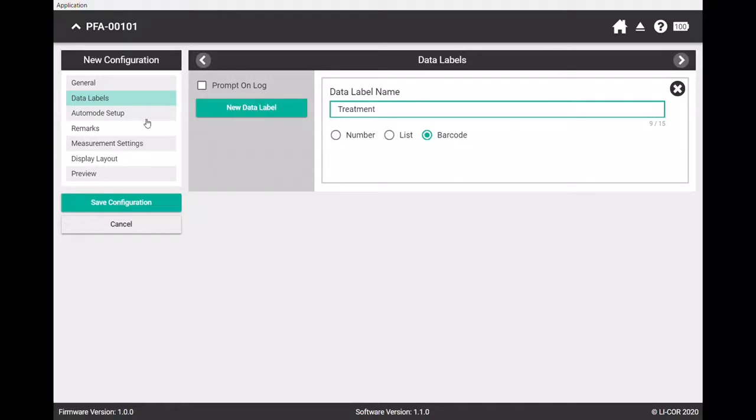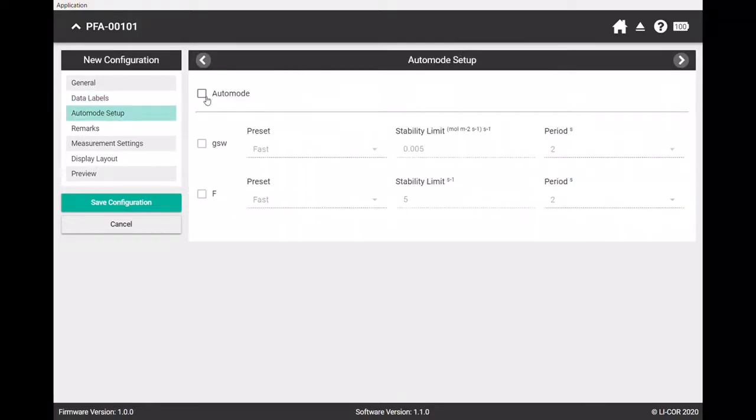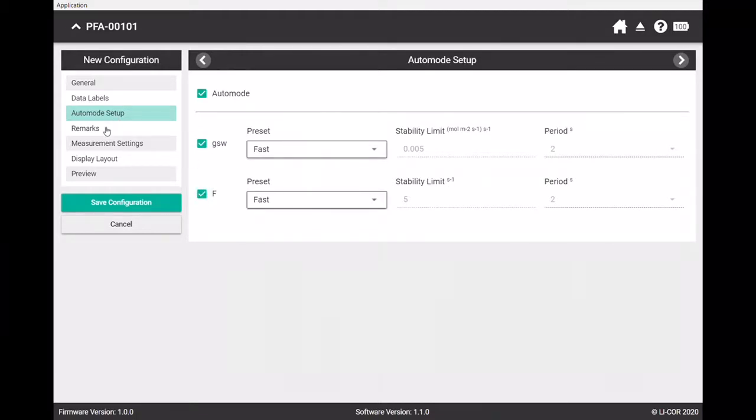And then we'll go down to auto mode. Yes, I do want auto mode, conductance and fluorescence, and I want to set them to fast. We'll go down to remarks, I'll add a remark just in case.